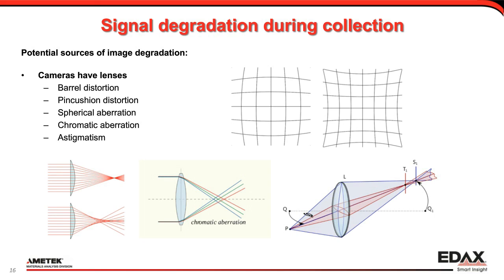We want to have a nice sharp image, and we want to have high sensitivity. Another one is chromatic aberration, which means that if you have light or a signal coming in, electrons or light with different wavelengths, they respond slightly differently in a lens and give an image at a different focal point. So that may make your image a little bit unsharp.